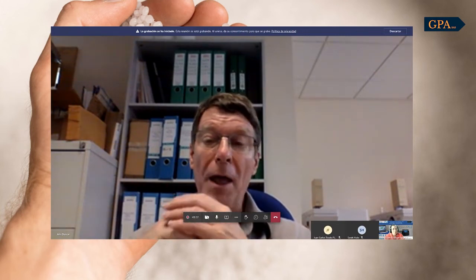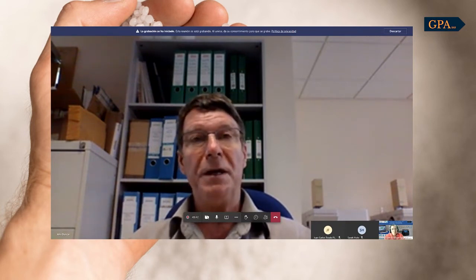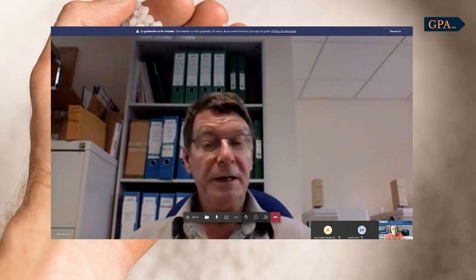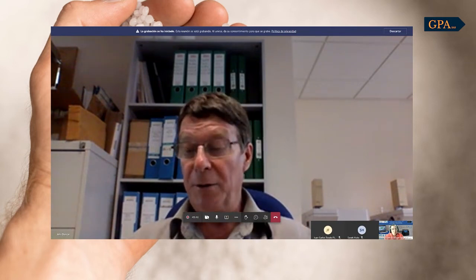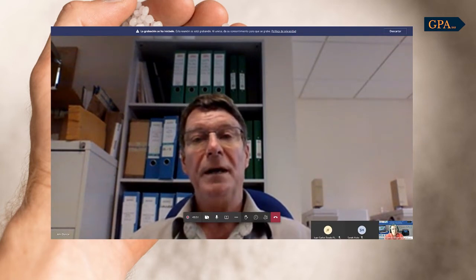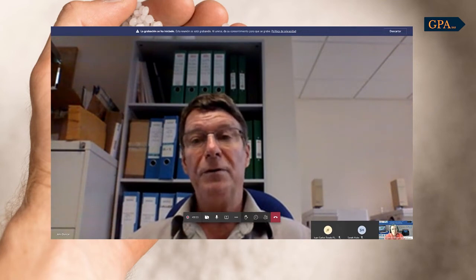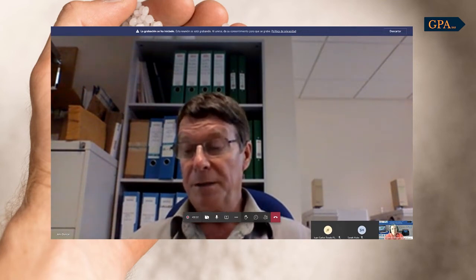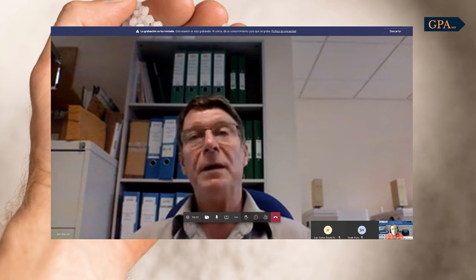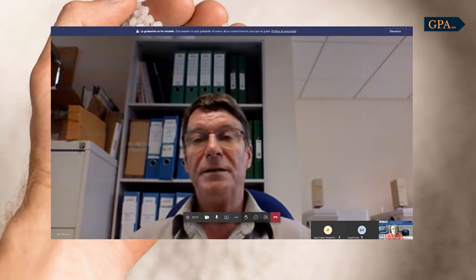And the main parameter that we use for determining whether the material is actually the same or not is this chemometrics value, where we automatically compare the difference between the tan delta curves for a material, which is a very good fingerprint for the material, and that's quite sensitive. But if the answer falls between 7 to 10, that means that it's so similar it's perfectly safe to use.